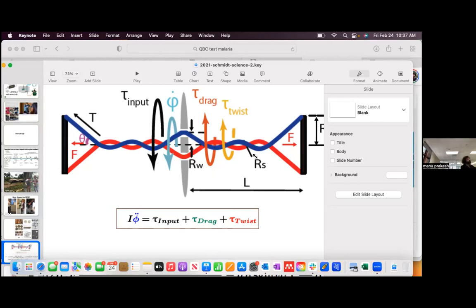So what's actually happening here? We have two strings through an object, and you can see that they can just go back and forth. It slides back and forth, right? So I'm just showing that. And any of you who have some buttons around, you can find a button that has two holes. Put a string in. But then if I push and pull on it, nothing happens, right?